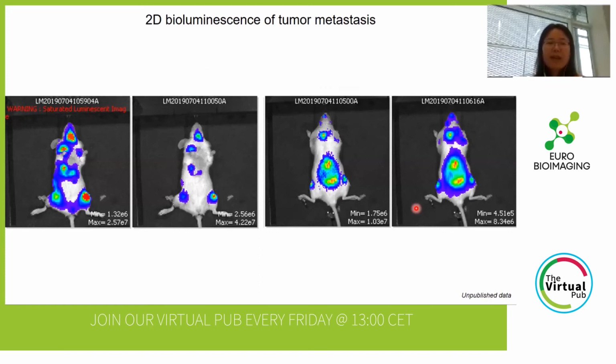When we have longer exposure time, we can see that the signal is basically everywhere. If we have a proper exposure time, we can see that the signal mainly focuses on the very strong area. So basically, we cannot really see if there are metastases really happening inside different parts of the organs.